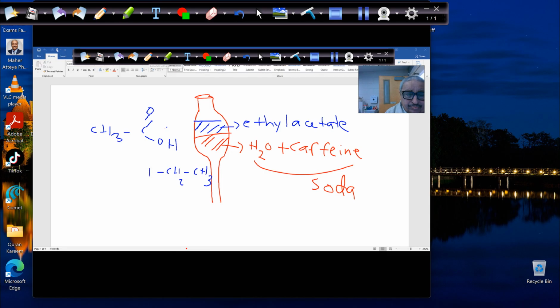So now you tell me how you get the ethyl acetate. We can go over it quick. Ethyl acetate is an ester, as mentioned with the fats and lipids. Those are organic esters, of course. This ethyl acetate is an organic ester, but it is polar. The fat and oil esters are non-polar.